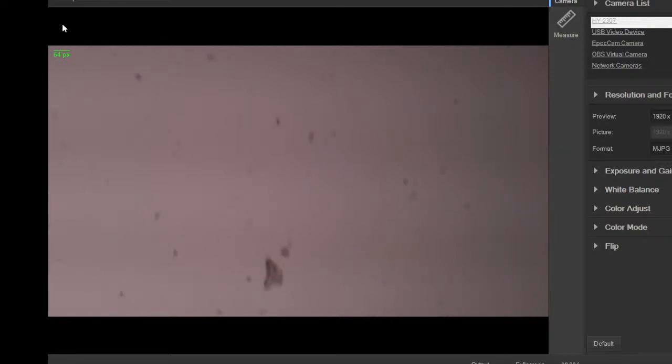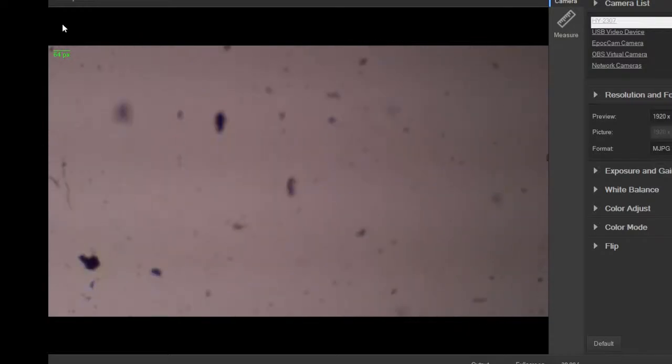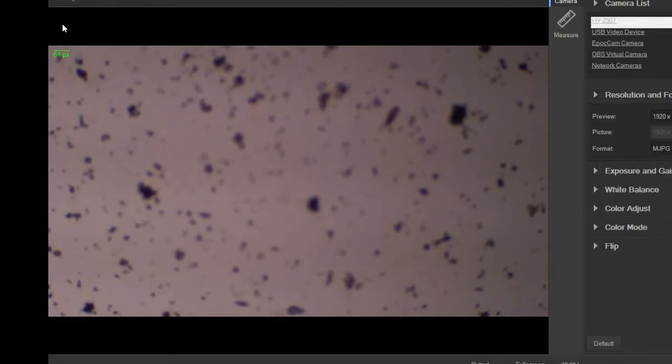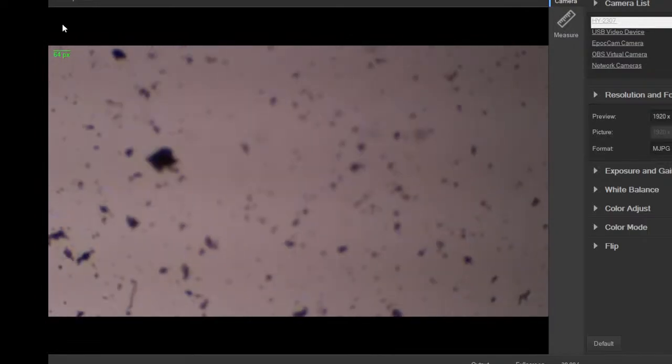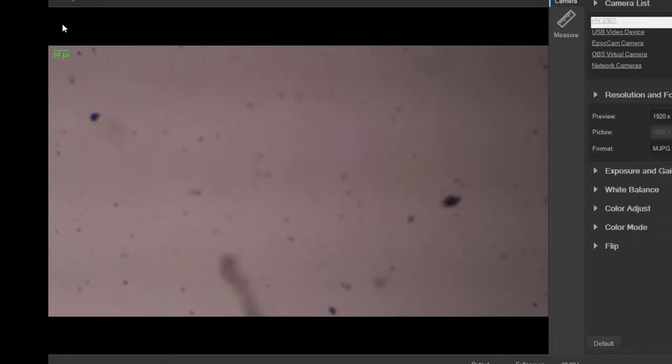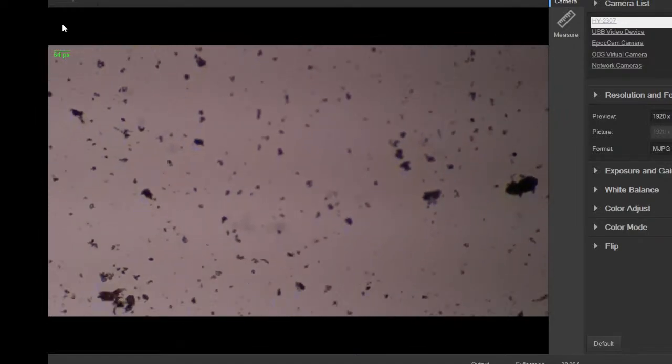Maybe something good here, you never know. Nope. Pretty boring so far. What's that there? Kinds of little debris bits. Picked up some kind of mud with it too, so you're seeing like crystals of stuff and other bits that would make up the mud.